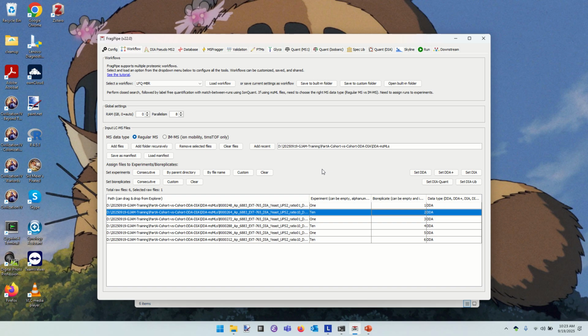I would also say that software like FragPipe Analyst, the statistical framework we're going to use to look for these differences, is really designed for 1 cohort versus 1 cohort. The software is not designed to do modeling of multi-factor studies, for example. Just to give an example of that, some of the people I worked with in South Africa enjoyed working with multiple species to evaluate their resilience under different climate conditions.